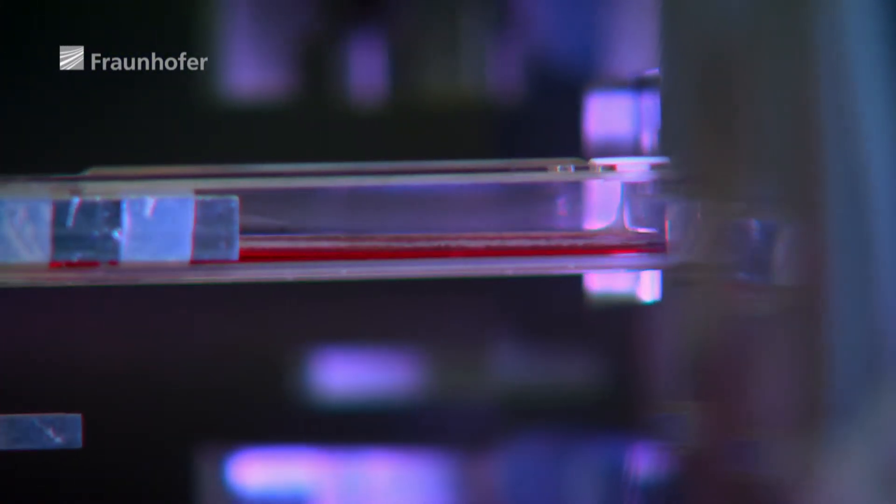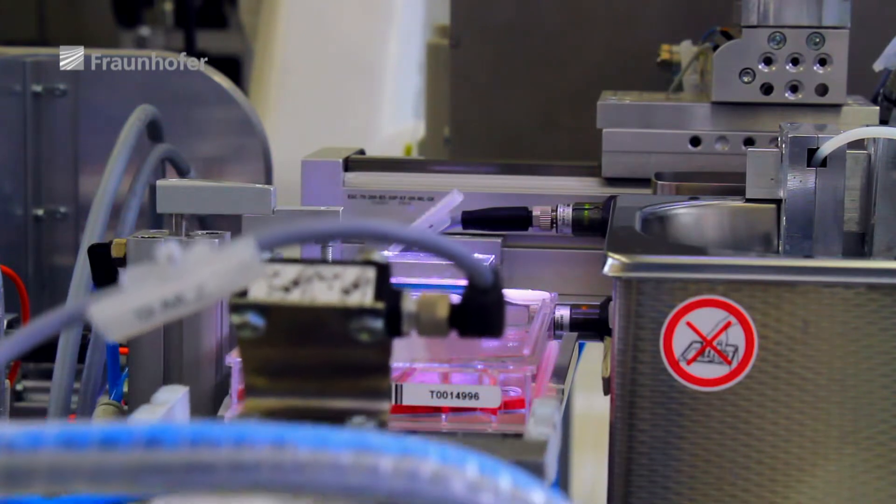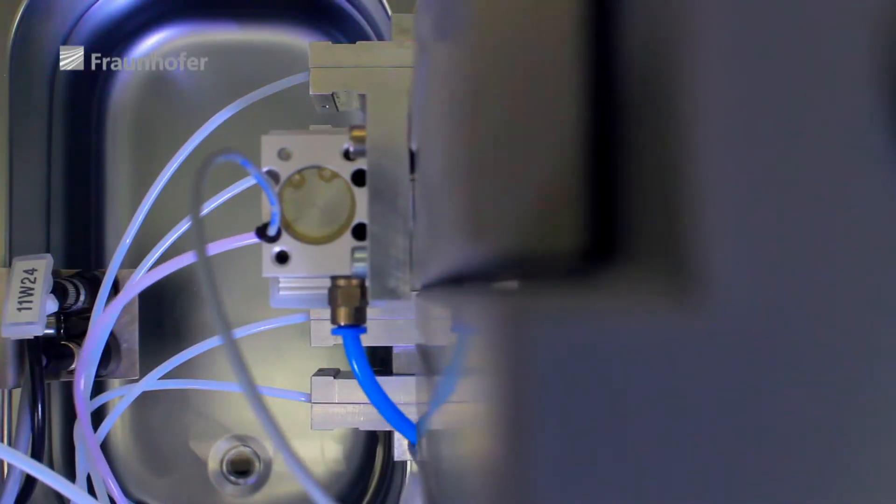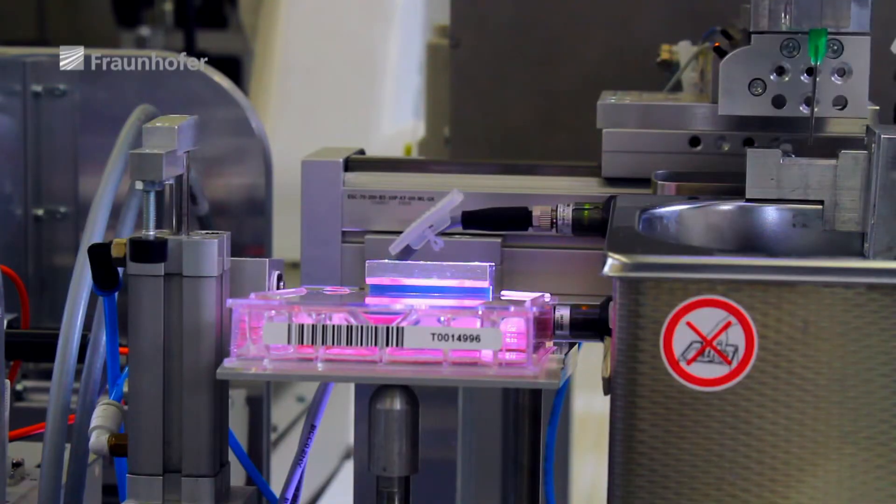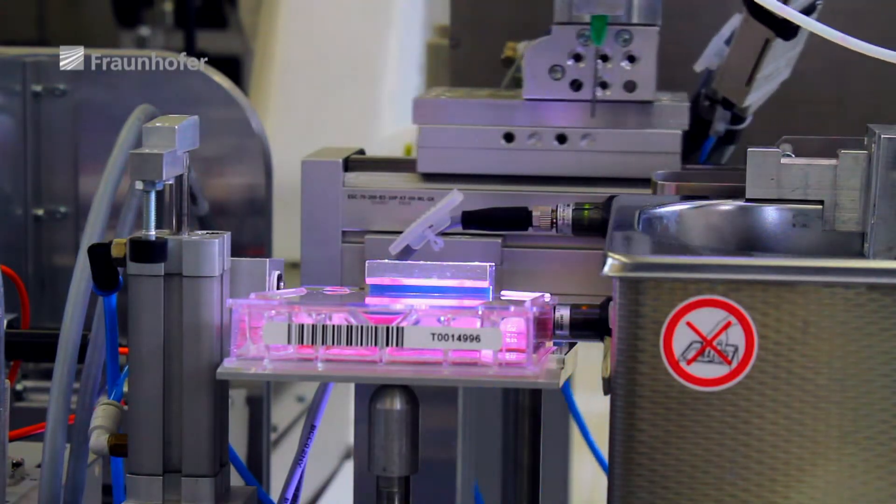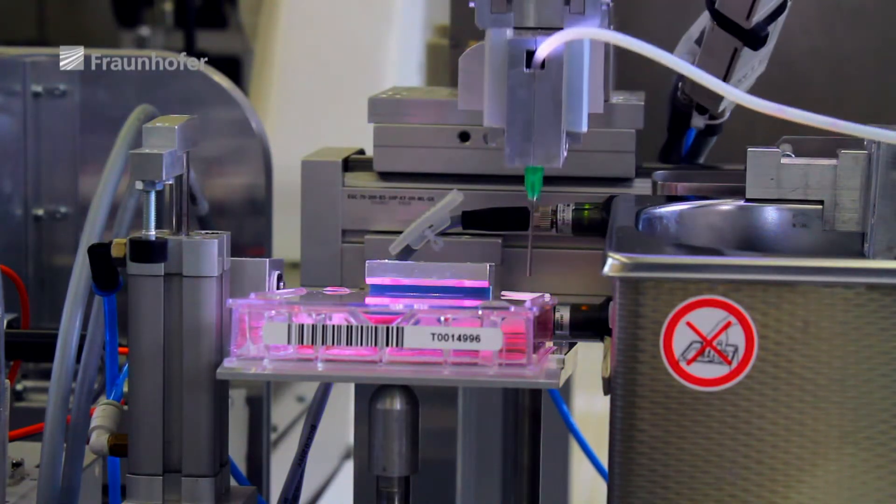In order to stimulate propagation, the cell cultures are placed in an incubator for about two days. A robotic arm regularly retrieves them so that cell growth can be examined and tracked. Depending on the growth, each dish receives its own special diet through a pipette.